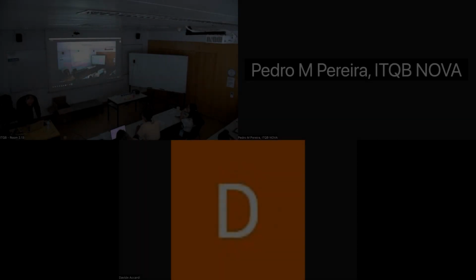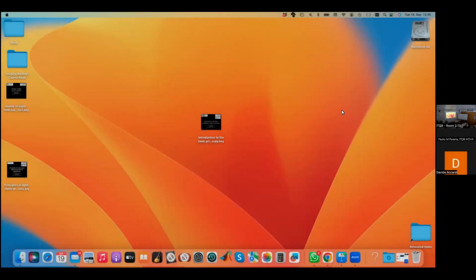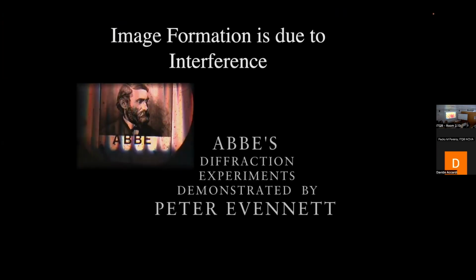Yes. Maybe this is stupid, but can you cheat on achieving resolving power using a monochromatic light source that emits only longer wavelengths? So you're saying let's use monochromatic light, and then we use longer wavelengths, and in this way we might resolve differently. This is what we do when we do fluorescence.